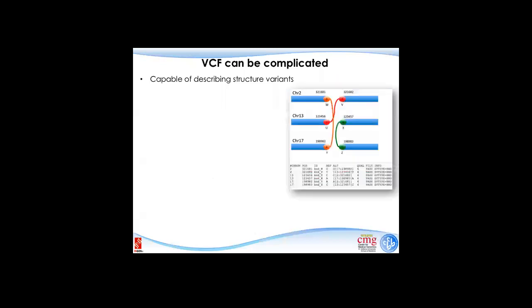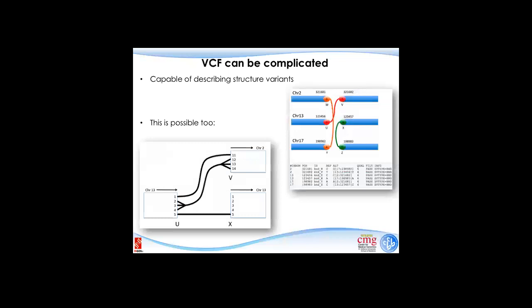So the VCF file I'm telling you about is very simple, like SNPs or small indels, but a VCF file can be very complicated, hosting many other types of structural variations as well. We don't really need to fully understand this at this point. But if your research leads you into this area, you can try to look into it. So basically, for structural variation, the VCF file will look like this. And actually, they can be more complicated as well, as in the original VCF file papers.